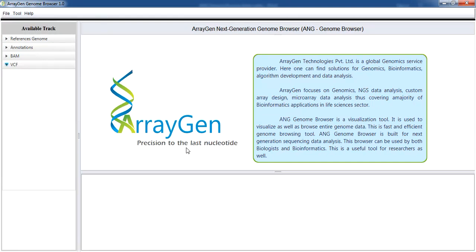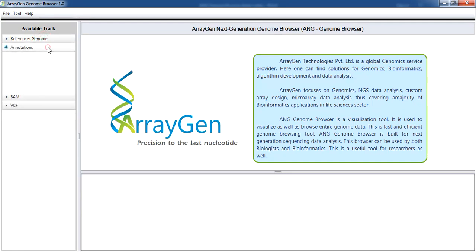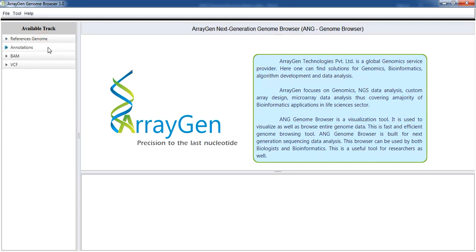Genome Browser strictly accepts FASTA format for reference genome, GFF, GTF, and BED file format for annotation files, BAM files for input sample files, and VCF for sequence variation files. On the left side are the list of tracks required for your genome visualization.